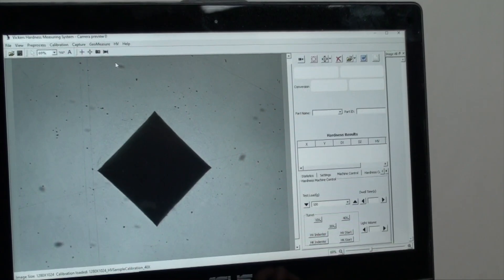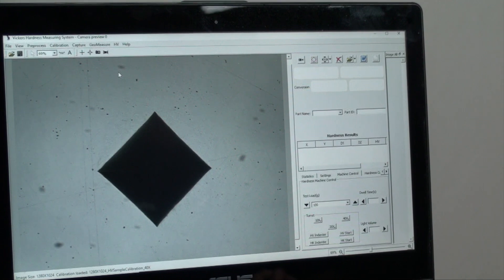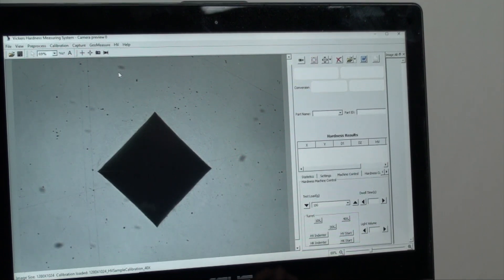Let's take a look at the software interface on our laptop here which is connected to the digital camera by a USB cable.